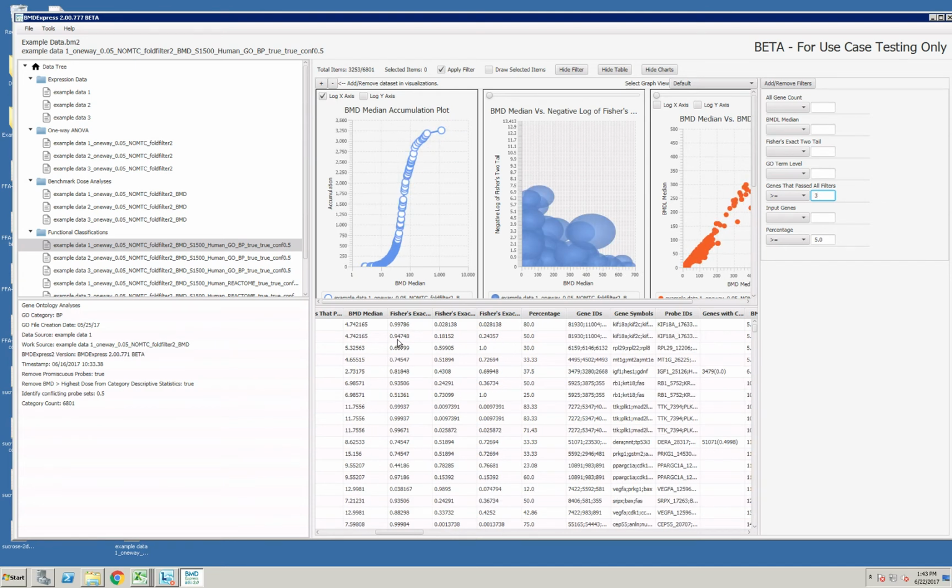One note is when we go to export this data, the filters do not apply, so everything pre-filter is exported. So you'll have to filter it again in Excel or some other tool to get back what you have in the filtered table here.